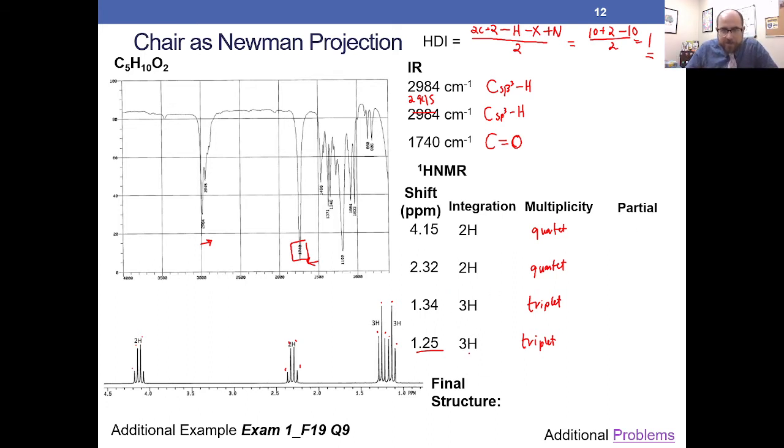So based on the chemical shift, the integration, and the multiplicity, I'm going to have a signal that has 3 hydrogens, and it's going to be attached to an atom that has 2 hydrogens. I don't necessarily know what's on the other end here, but I'm going to indicate the fact that I'm going to circle the 3 hydrogens. That's the signal that I'm talking about. Again, it sees 2 adjacent hydrogens plus 1. That's going to get me to my triplet, which matches the integration that we're given.